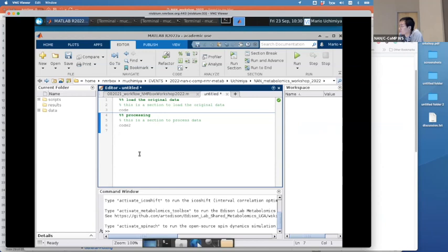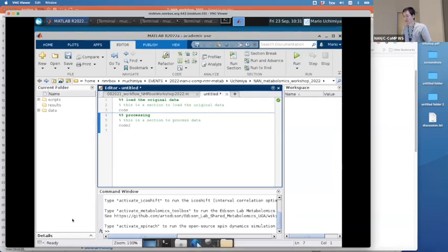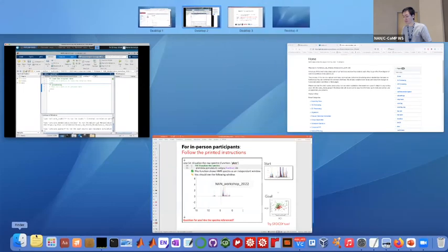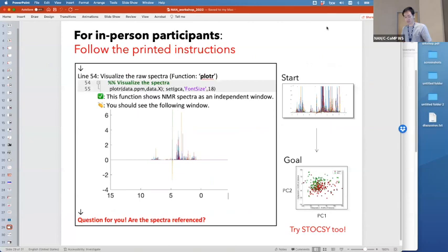After the normalization, there's another renamed data file. After water is removed, there's another renamed data file. So you really have to go through those steps, and then you get down to the PCA and say, look at that, now I can do it. But if you want to see what an error looks like, just read in the data at the start and then try to execute the PCA at the bottom, and you'll see a big error that something's not defined.